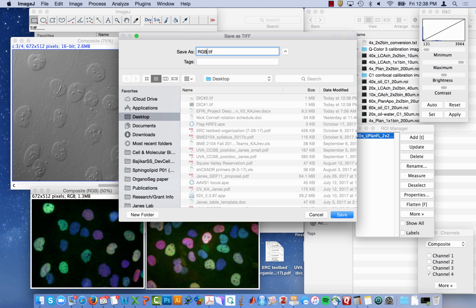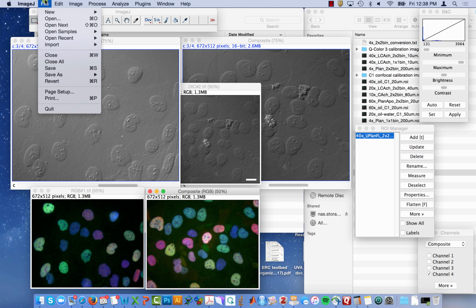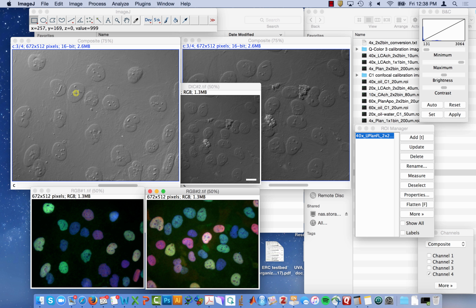RGB, number 1. RGB, number 2. All right.